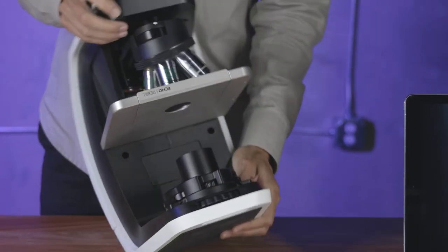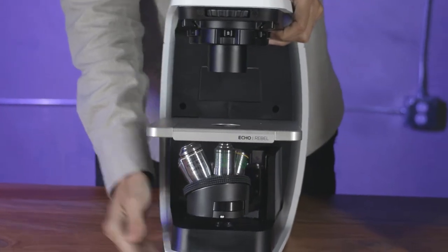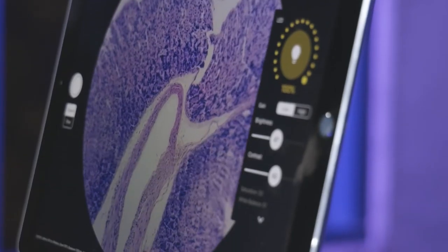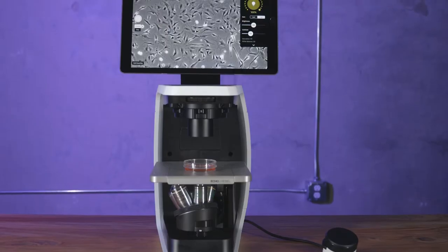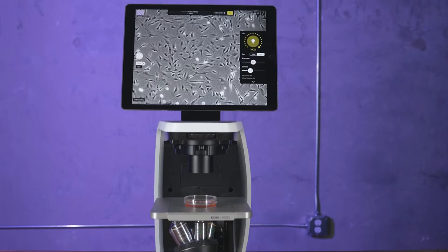REBEL is a hybrid microscope and can easily convert between both upright and inverted modes. This gives you two systems in one, where you can look at glass slides and brightfield, and in seconds, switch over and look at live cells using phase contrast. This saves you resources, bench space, and valuable time.